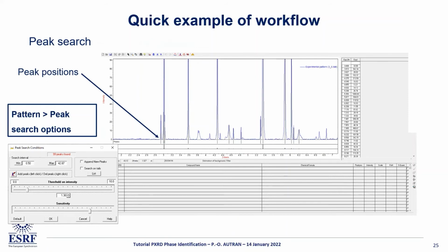When a peak is detected by the software, you see this vertical black line that tells you, okay, there I found a peak. On the second very tall peak, after it you have a little one that has two little peaks hidden within. These are not detected by the software, meaning they're missing. And if they're missing, you're less likely to be able to identify the phase that corresponds to these peaks.